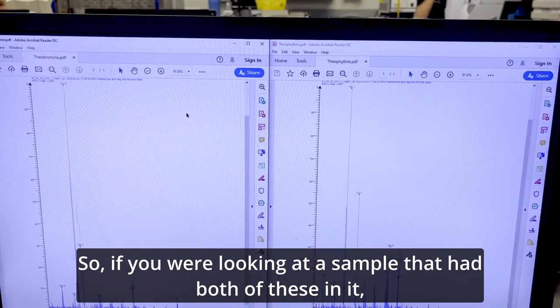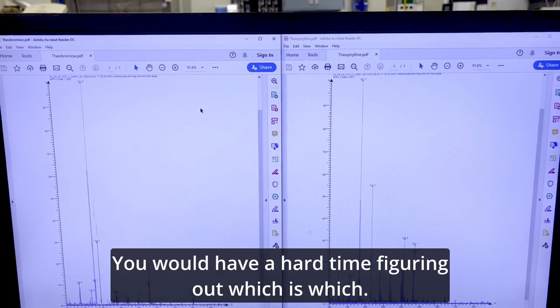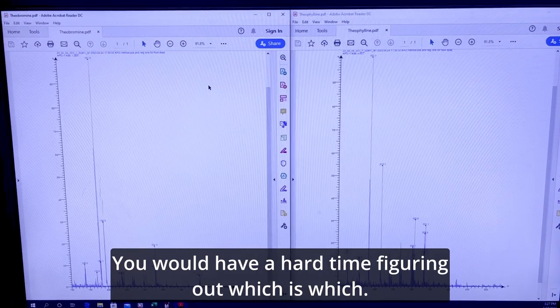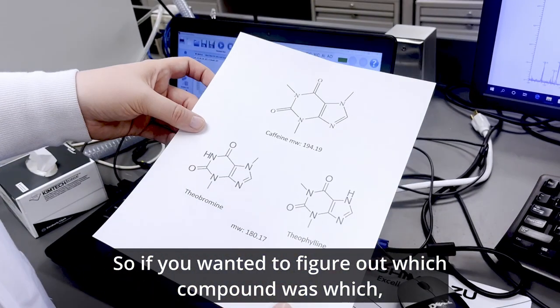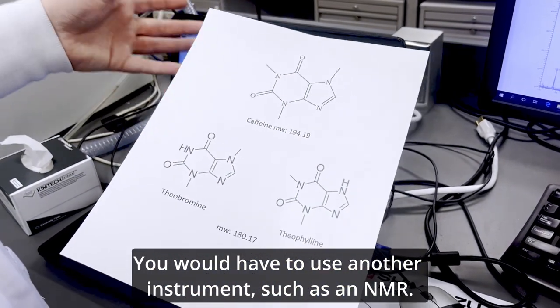And this one is theobromine, and this is theophylline. So if you were looking at a sample that had both of these in it, you would have a hard time figuring out which is which. So if you wanted to figure out which compound was which, you would have to use another instrument such as an NMR.